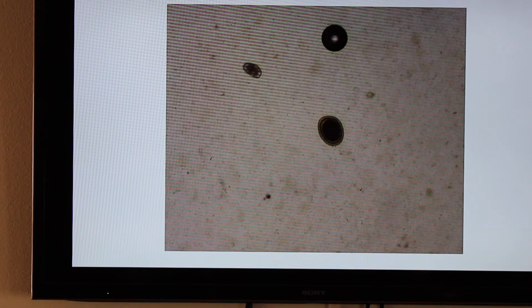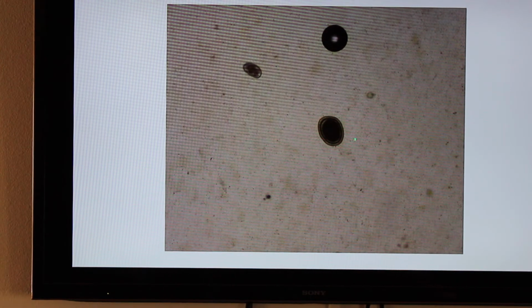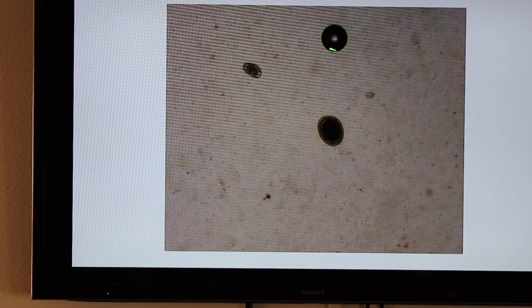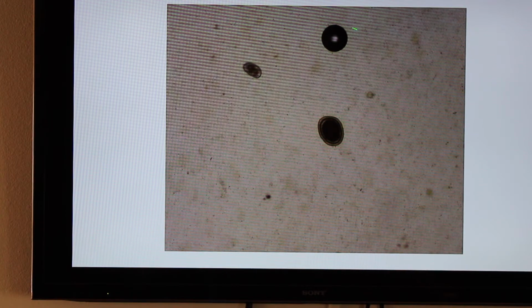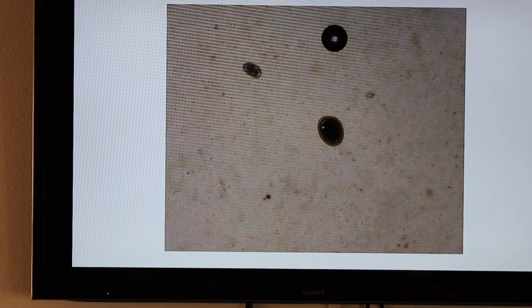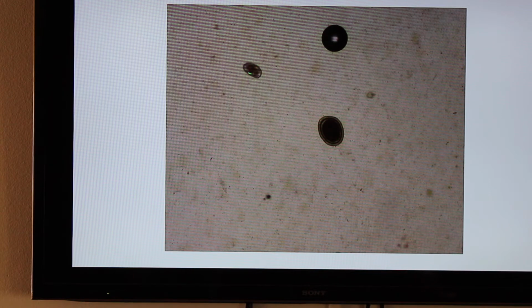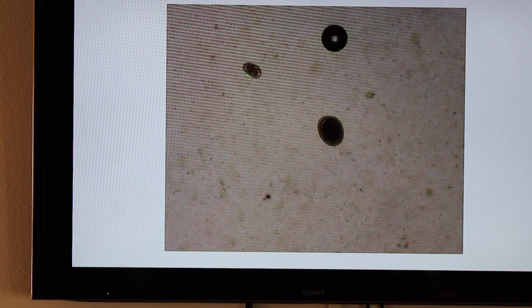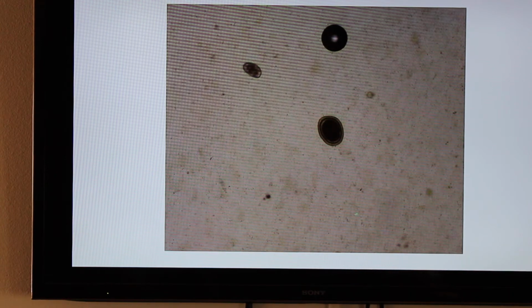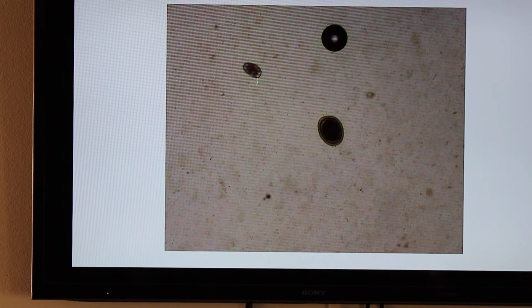This image is our first kind of comparison image to show you a roundworm versus a hookworm and an artifact. So we have this fun little air bubble that sometimes likes to play mind tricks on you. And then seeing this roundworm, the size of it and the outer shell. And then our little hookworm has a thinner shell and almost a bunched up looking material on the inside. And then remembering to use our fancy words, we have Toxocara canis and Ancylostoma.